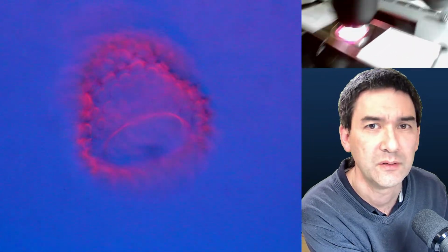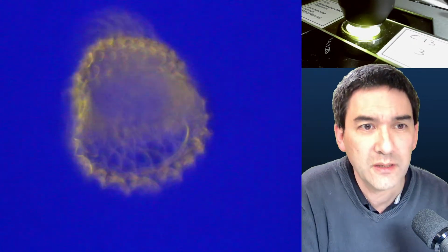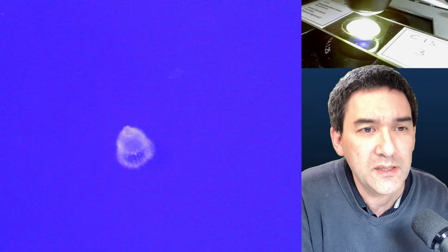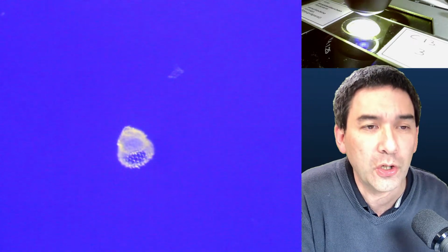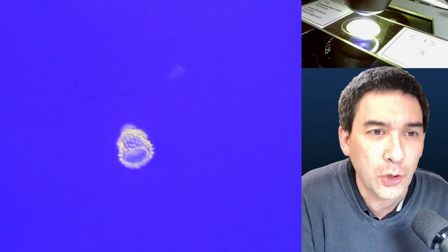So I'm going to change now the filter. I'm going to put in a blue-yellow one. This was a red-blue one, and now the center is blue and the periphery is yellow. And this is how it looks here. So now you see the background is blue and the specimen is yellow. That's why it's a good idea always to make sure that the central part is darker, because then you see the specimens brighter on a slightly darker background.